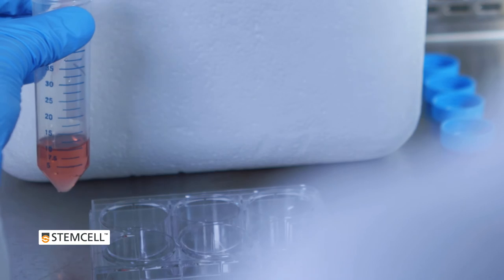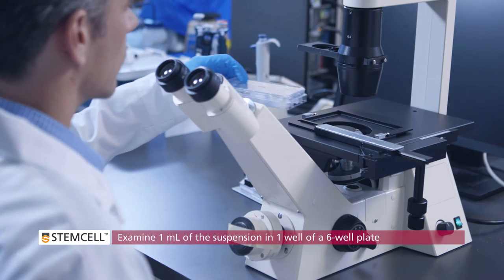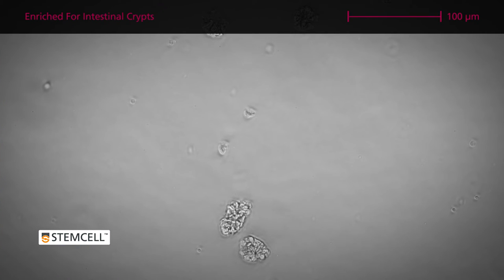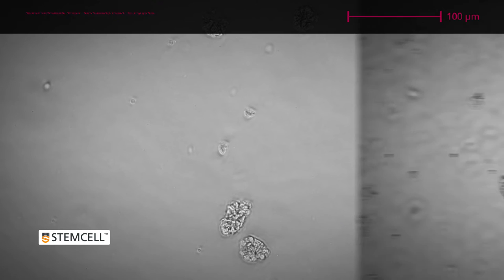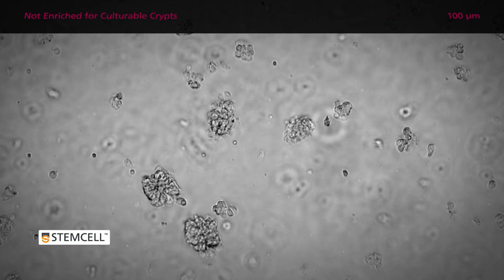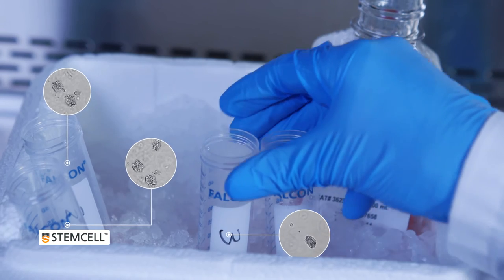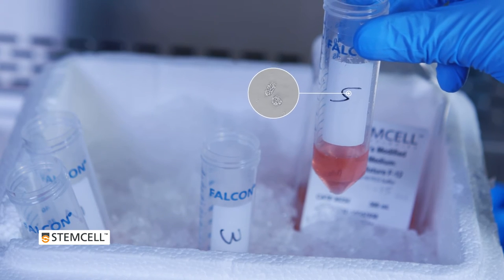For each fraction, re-suspend the pellet in 10 mL of cold DMEM-F12. Assess the quality of each fraction by examining 1 mL of the suspension in 1 well of a 6-well plate under an inverted microscope. The best fractions are enriched for intestinal crypts, which can be of various sizes and appear like small folded sections of an epithelial monolayer. Fractions not enriched for culturable crypts contain higher concentrations of villi, single cells, or debris. Select one or two fractions to use; most often fractions 3 and 4 will be the most enriched.